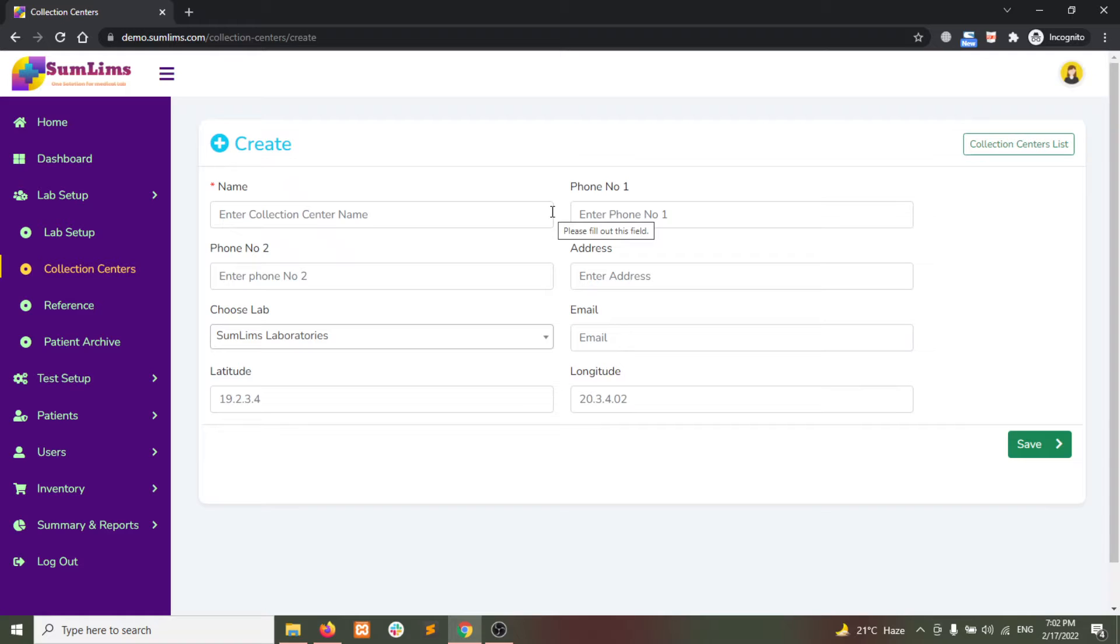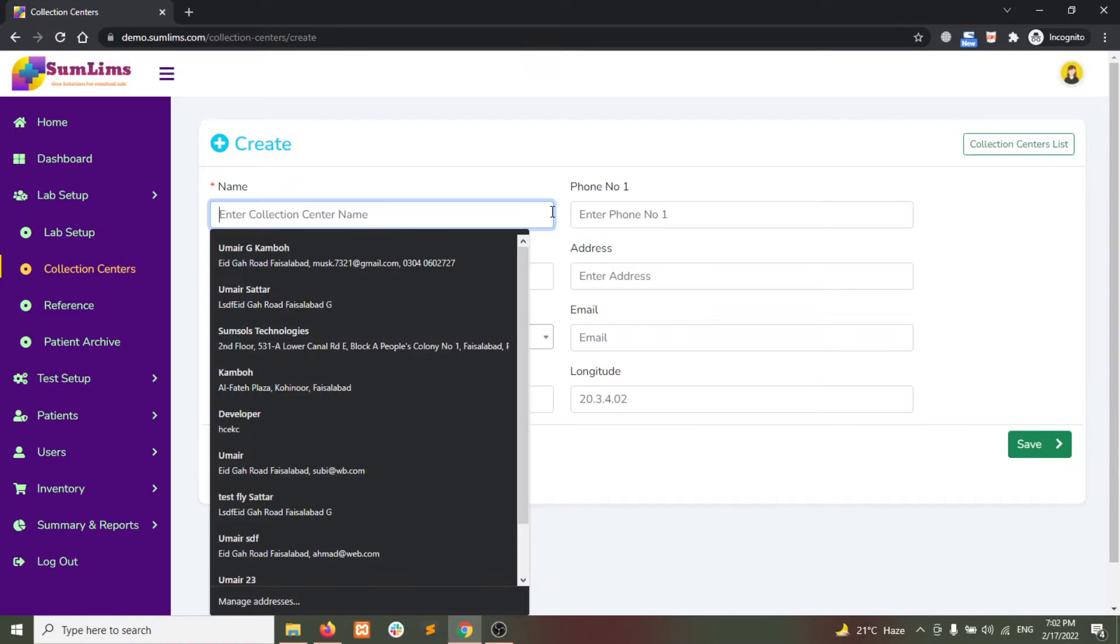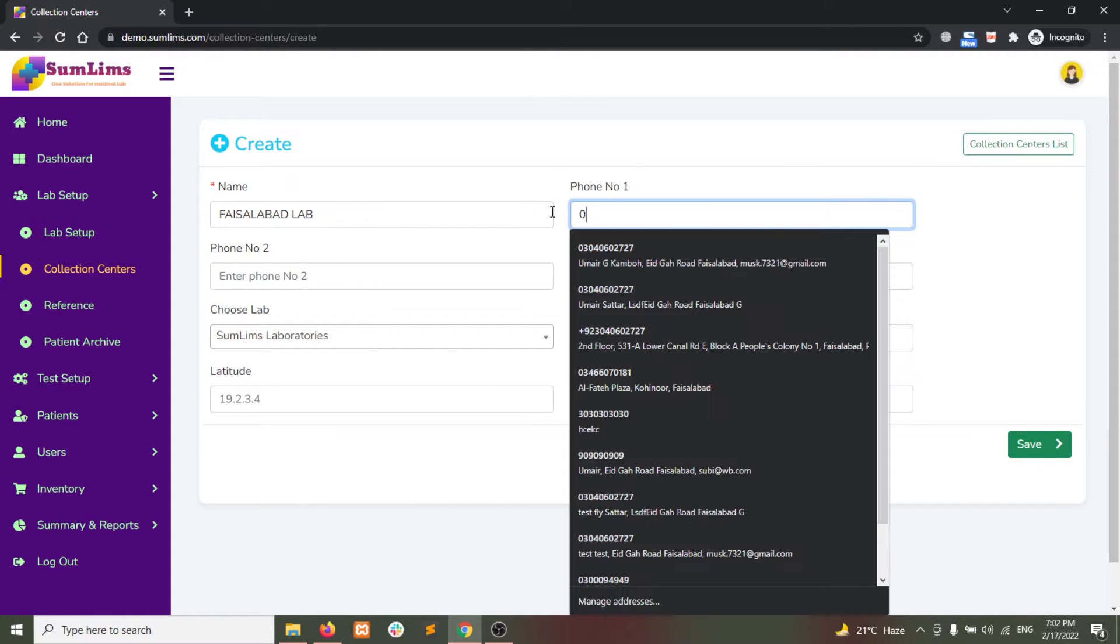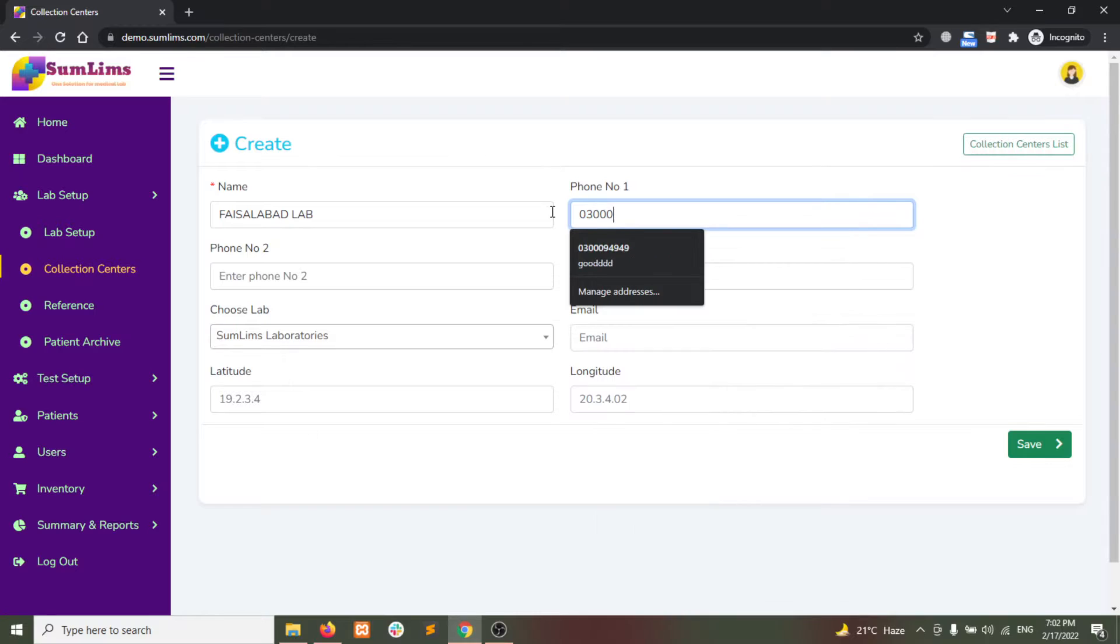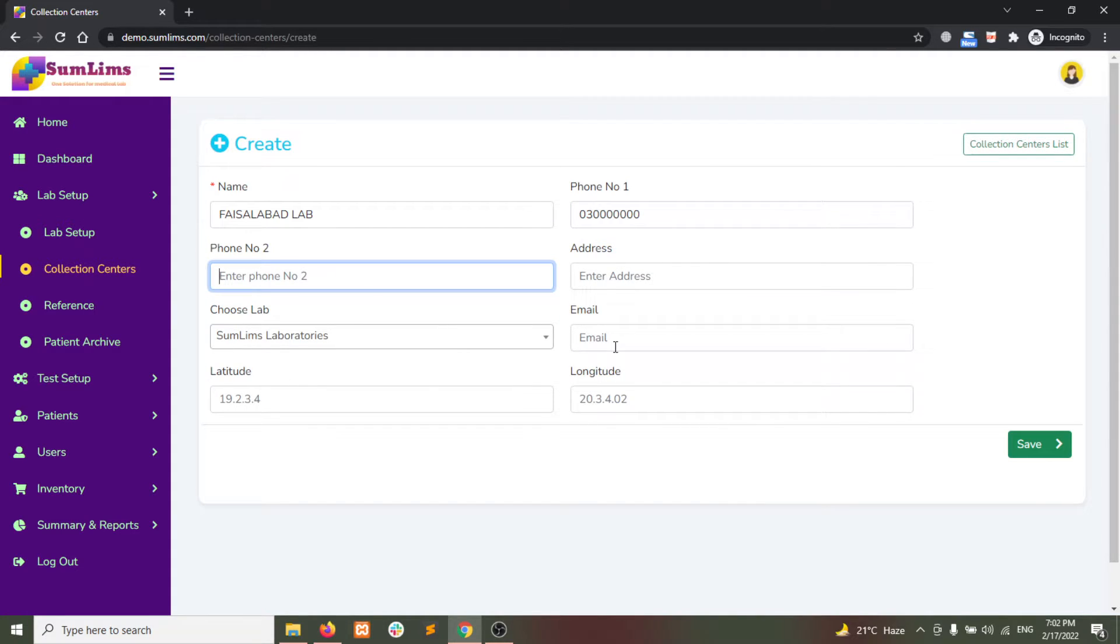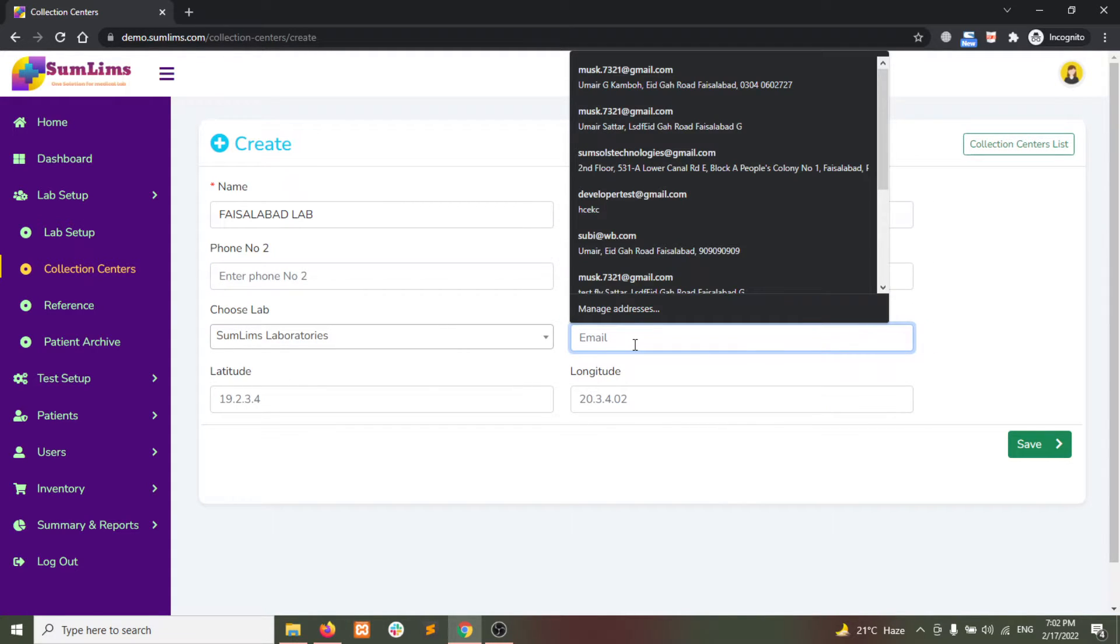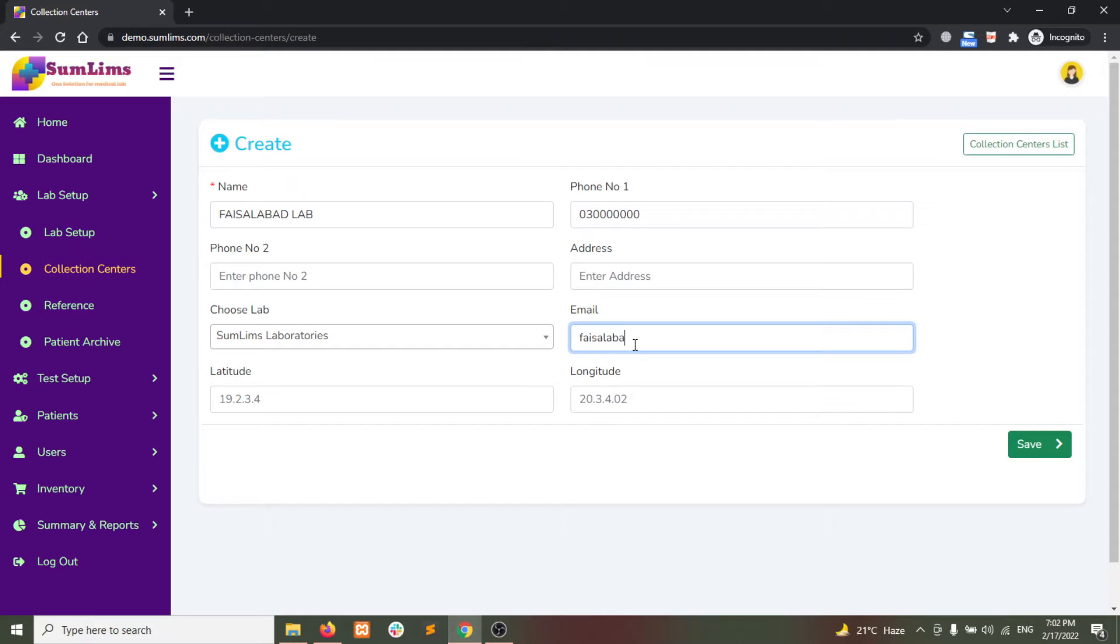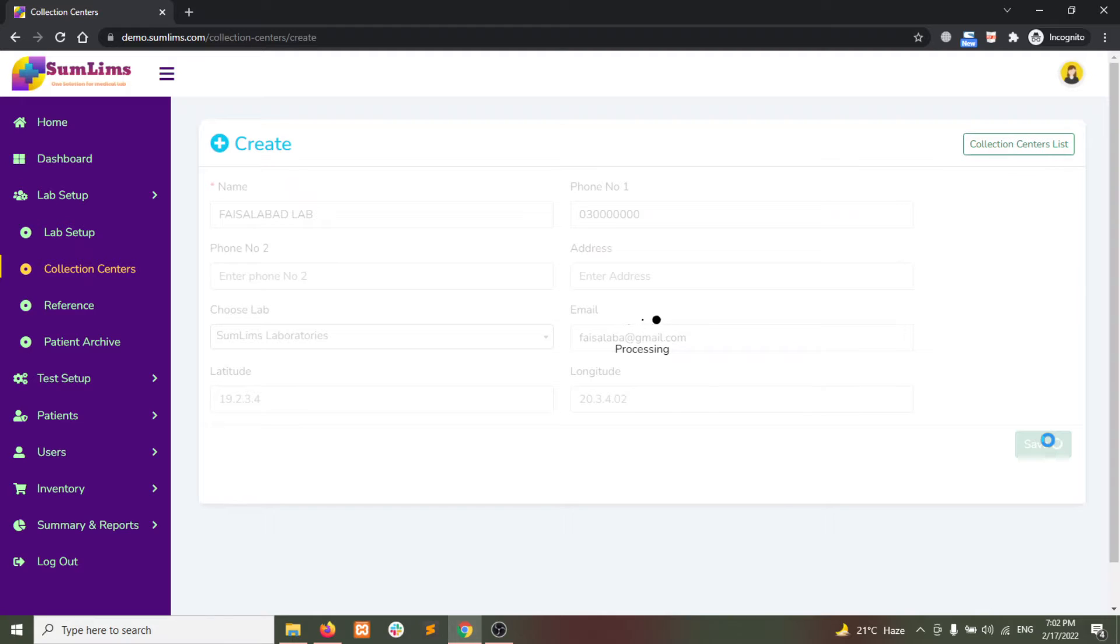for example, lab name, the contact number, the email address, and then click on Save.